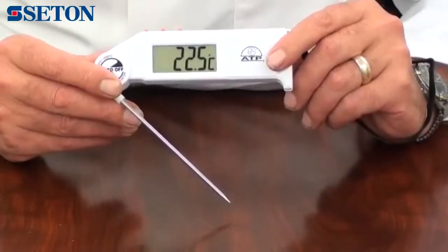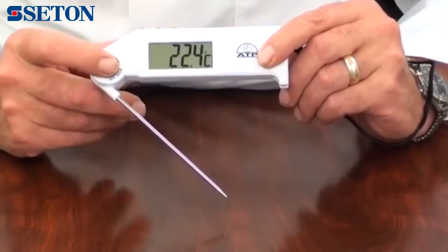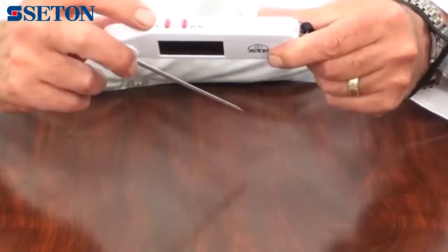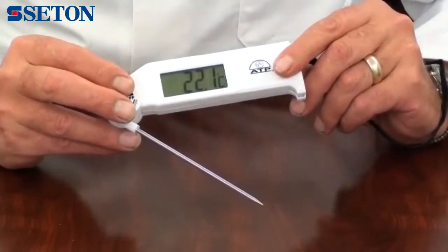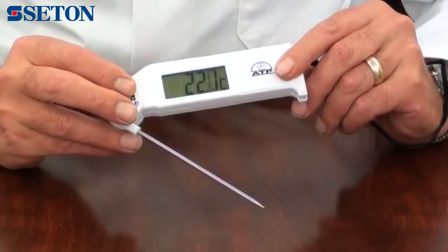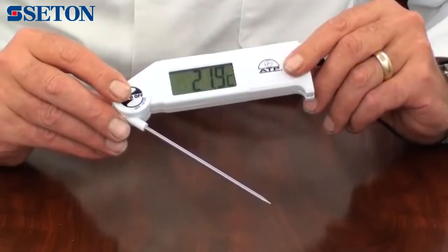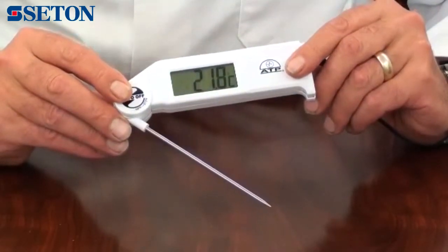The display is a 22mm high contrast LCD featuring large digits and function indicators. The thermometer features data hold — when pressed, it will hold and display the measured value even if the probe is removed from the sample. A min-max memory is featured that will display and hold the lowest and highest recorded measurement since power on or last reset.